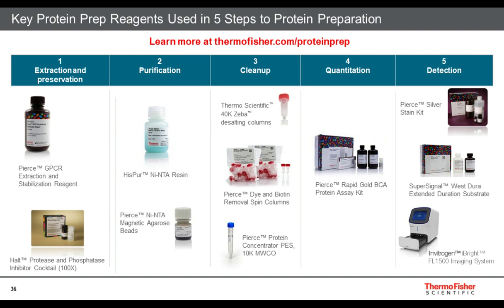Lastly, I just wanted to reiterate the 5 steps in the protein preparation workflow, starting with extraction, preservation, purification, cleanup, quantitation, and detection. And I've highlighted a few of the critical reagents and tools used to generate the data that I showed here today.